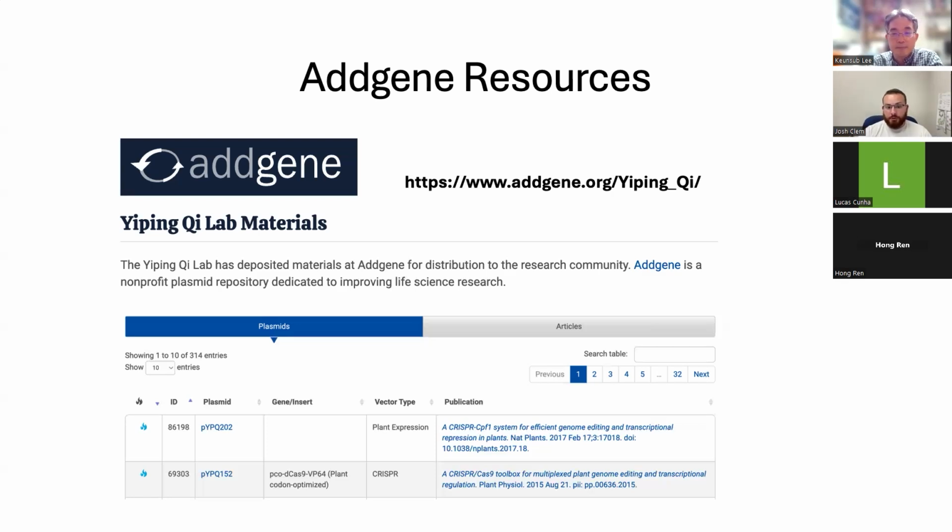Let's say we have 20 different plants, and let's say we're looking at one particular target site in addition to multiple other target sites, but we'll just focus on one. We amplify each of those plants with a first round of PCR that holds adapters on the end. And then we follow that with a second round of PCR, kind of like a nested PCR, with primers that contain unique barcodes on the end.